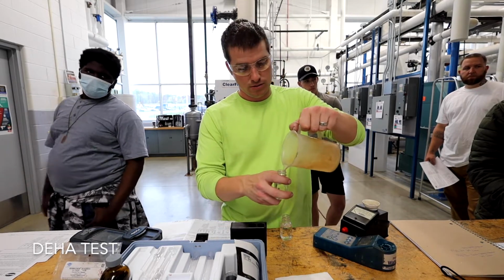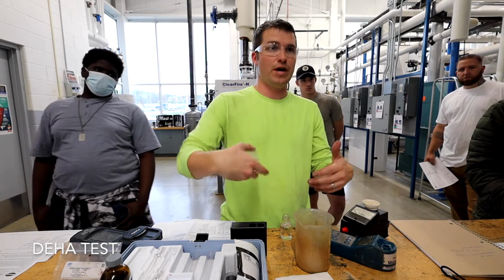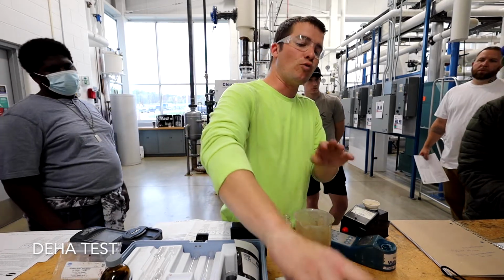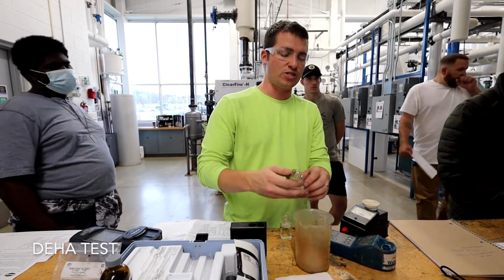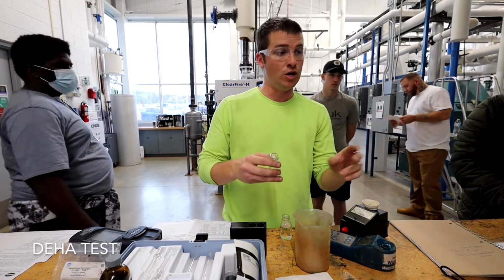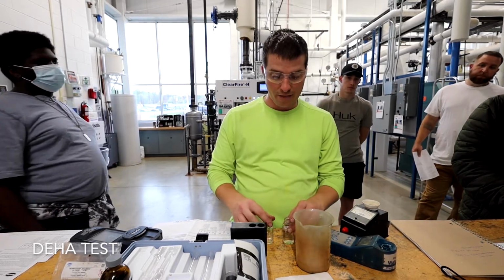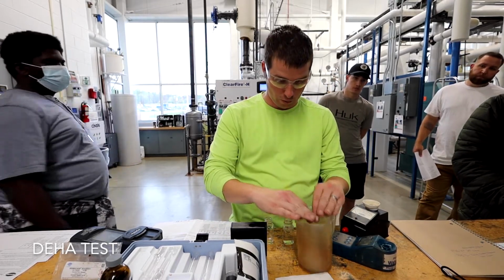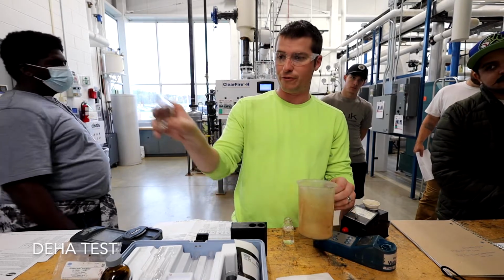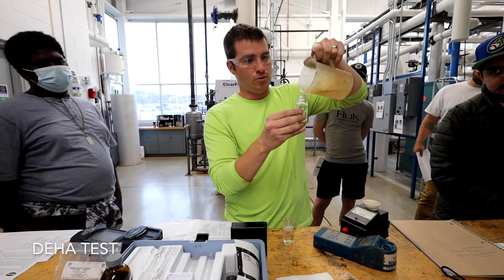Well, you're going to want to rinse that second mixing bottle. Yes, both. For running the test, we can rinse it with our sample. When we're done running the test, we'll want to rinse them both out with this for storage. Then we know there won't be any residual from the test. So I've rinsed both now with current sample thoroughly. I'm now going to fill up my blank to that 25 milliliter line marked on there, and then we'll go to the next step.